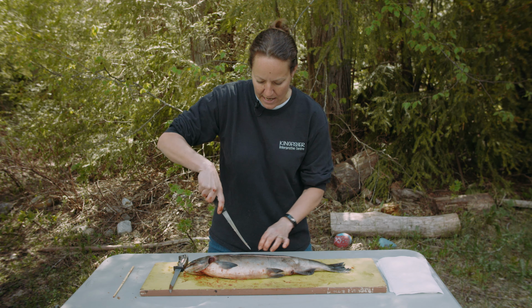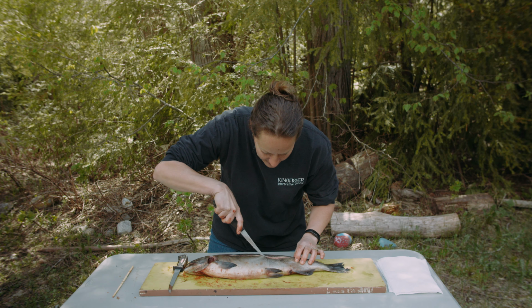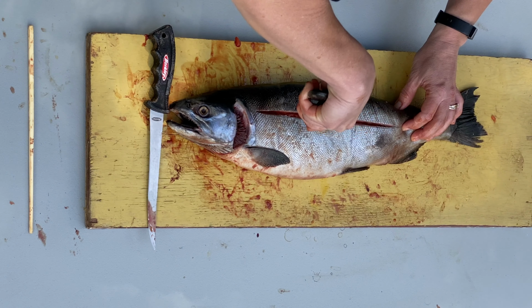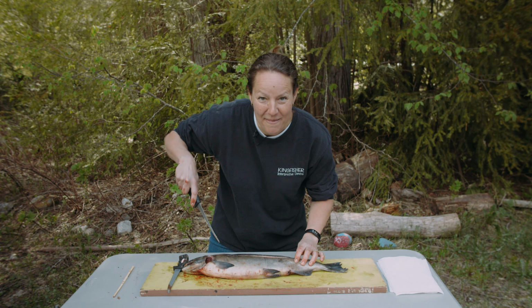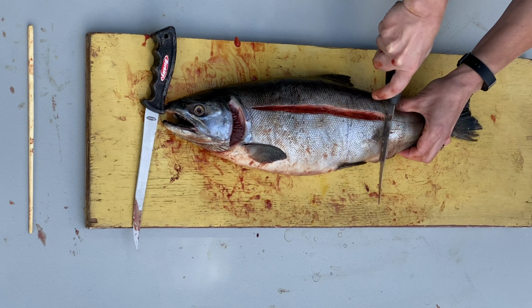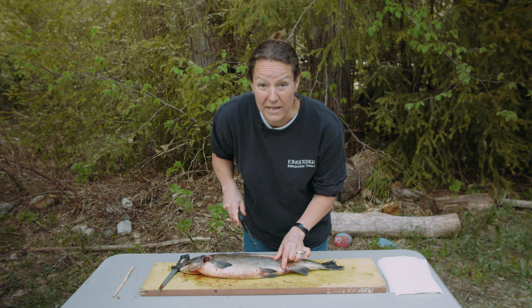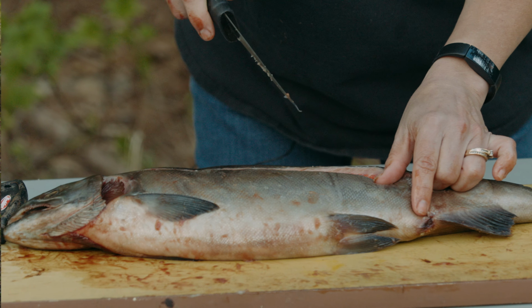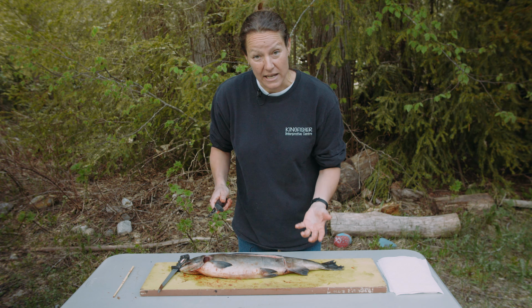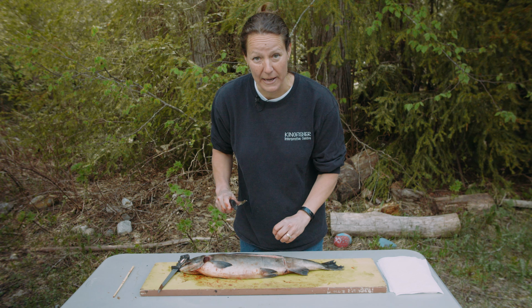Just like that. And if we listen, you can actually hear the backbone. I don't know if you can hear that. I'll do it one more time. So that's the backbone of the fish, boys and girls. Now I'm going to cut down here to the vent. Now the vent is where the eggs would have come out, or if it was a boy, it's where the milt would have come out. It's also where the excess food that isn't used will also be released from the fish's body.